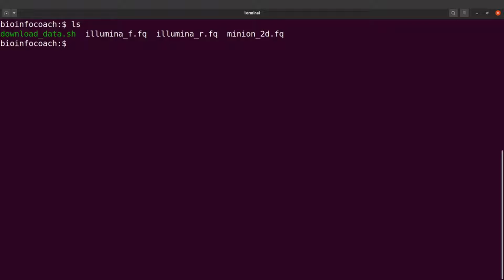We are now going to install Unicycler. We are going to use conda to do this, so make sure you have installed anaconda. If you have installed anaconda, then what you have to do next is to add conda channels. We are going to add one channel, and that is bioconda. So I'll say conda config add channels, and I'll say bioconda. The channel has been added, so now I'm going to create an environment and install Unicycler in it.